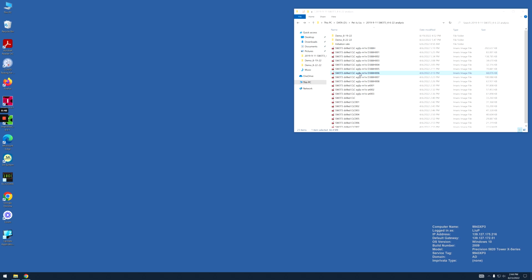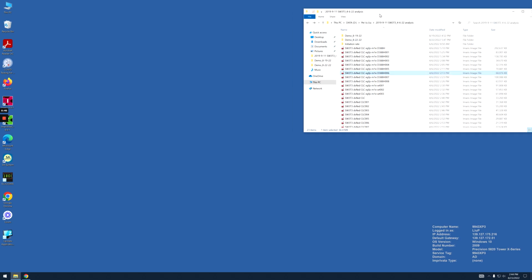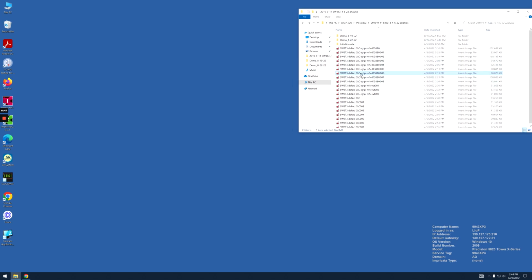In this file, I already double checked that I can get that information there, so I decided to use this as my demonstration for today. For people in the future who need to use this lifetime analysis, please contact an Imaris specialist to double check with them how to get this information to show up, so you can keep going on with your analysis.